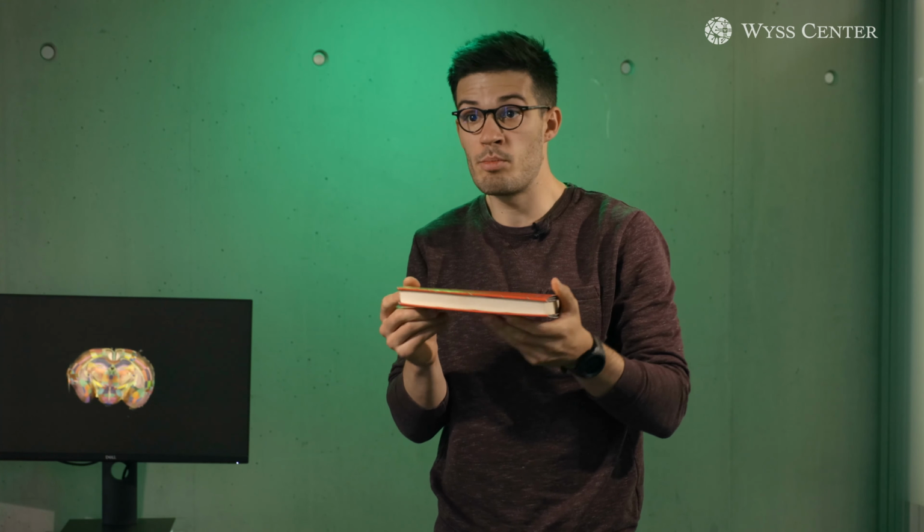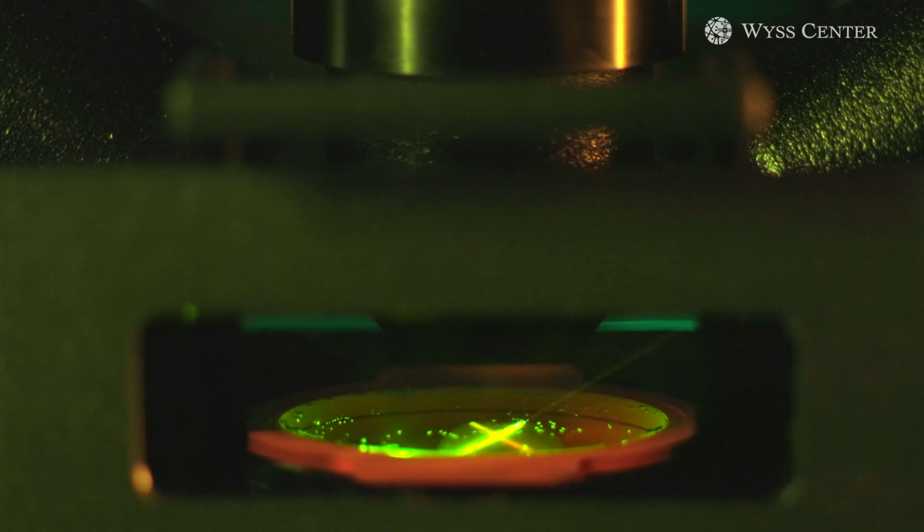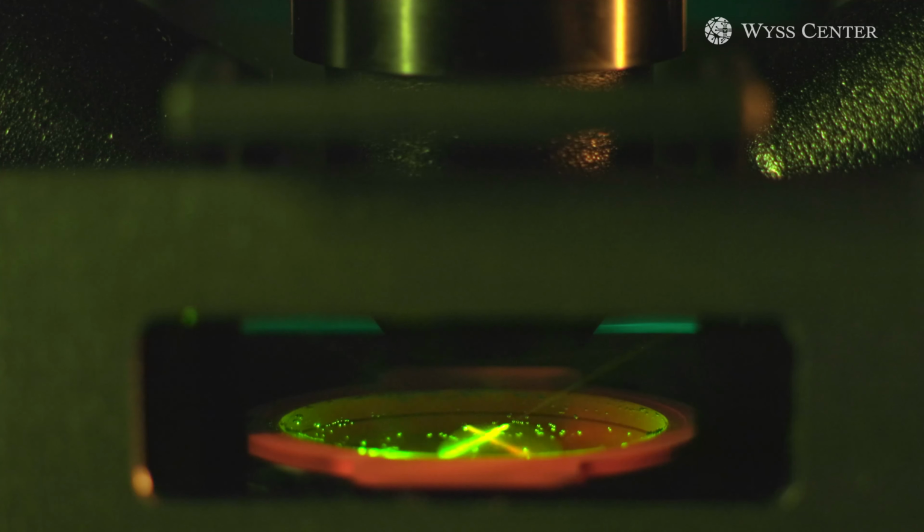The previous generation of light sheet microscopes were illuminating the samples from the side. But today the next generation of light sheet microscopes are illuminating from above. So now we can fit larger samples like this book, and we're illuminating them from above, from both sides. This new generation of light sheet microscopes allows us to image a whole human brain in only 10 to 12 sections.